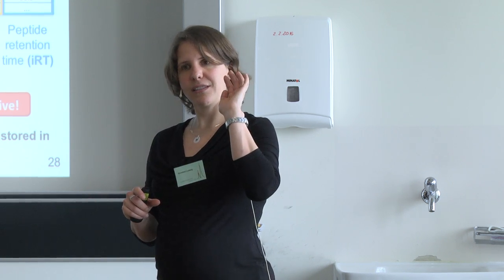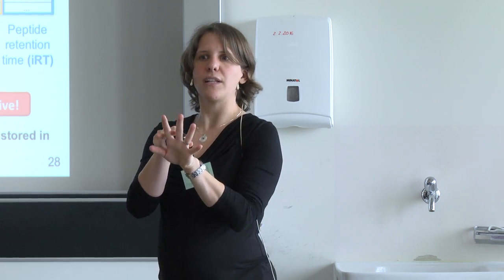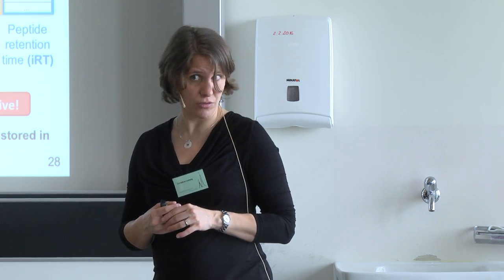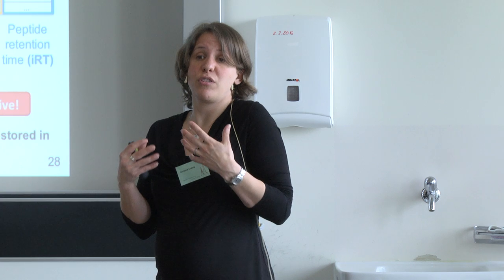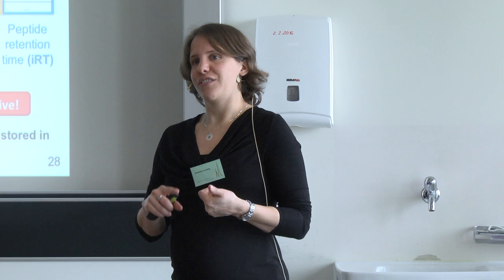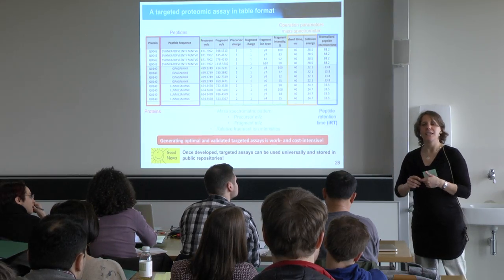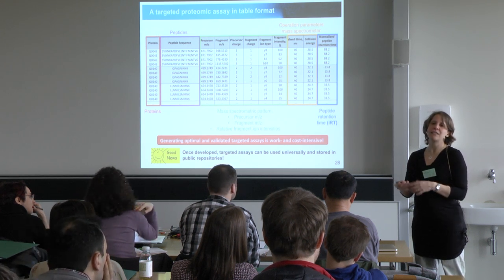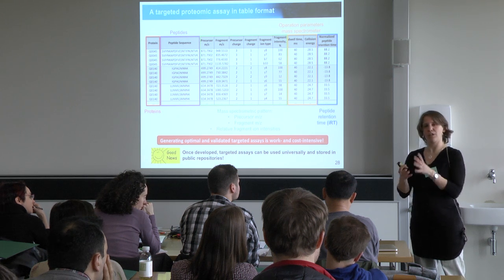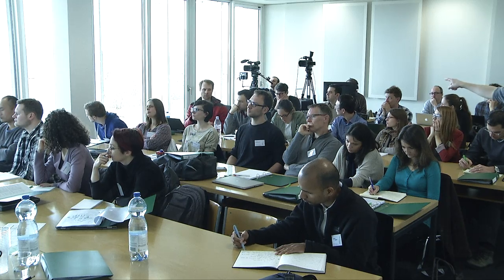So if you want to select 5 transitions for a peptide, you can use 2 in the doubly charged and 3 in the triply charged charge state. Nothing prevents you from doing that. Do you see what I mean? So usually you would go always for the most intense ones. But for most peptides in SRM, the doubly charged version is very often more intense than the triply charged on triple quads, but not always. And usually one charge state is significantly higher than the other. So it's rare cases where you end up with 2 charge states and still would like to work with both of them.